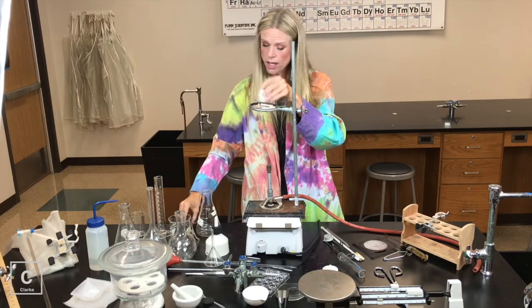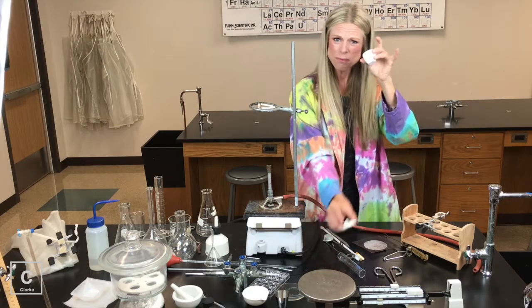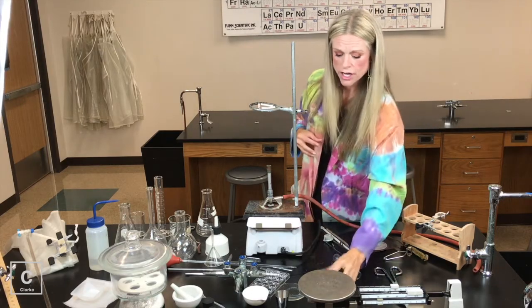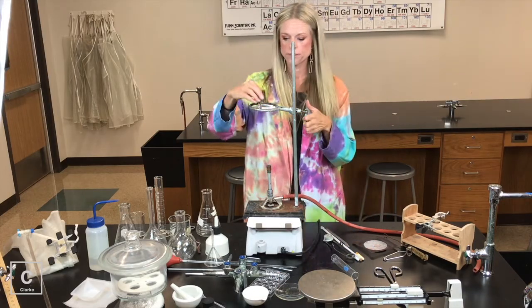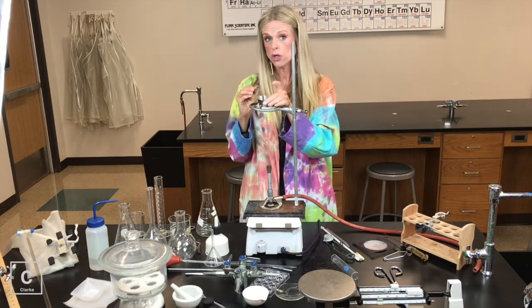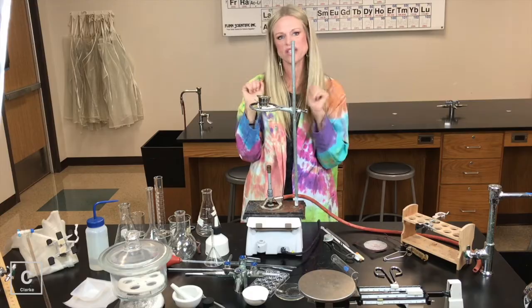For some reason, these are supposed to take really high heat, but in my lab they've been breaking. So I've started getting these metal ones as well. In your lab, you might see these metal crucibles and crucible covers — they're going to do the exact same thing.